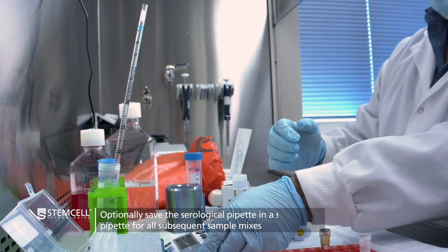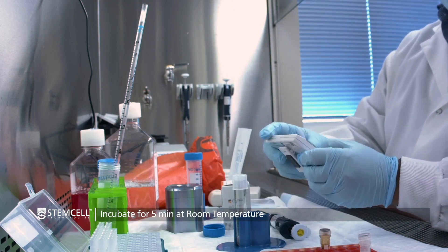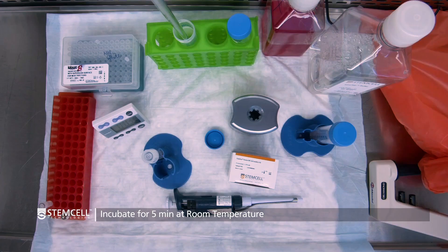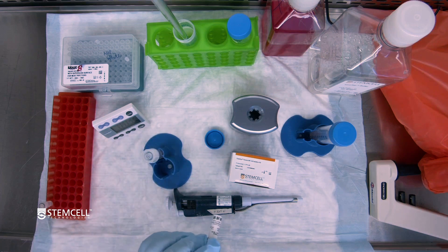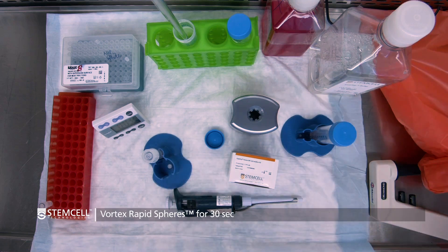Having added the cocktail, now you can start the five-minute incubation time. While the cocktail is incubating, you will then want to take your particles and vortex them. Make sure to vortex these for 30 seconds to ensure that they're evenly dispersed.